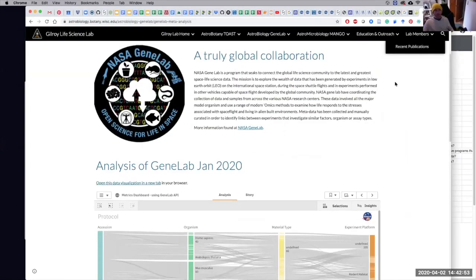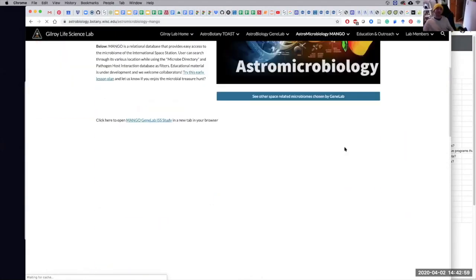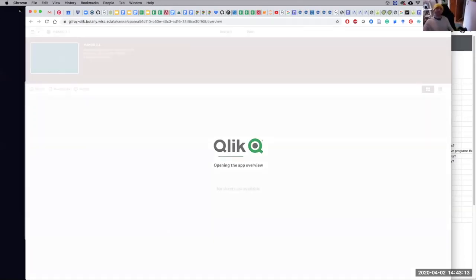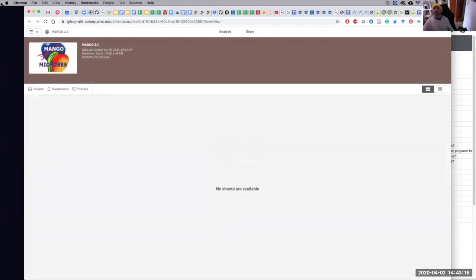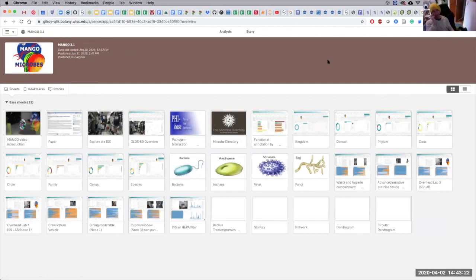Okay. So what I want to quickly do last is go to Mango. Mango's fun. Launch in a new tab. Again, classic thing: if you forget how to use it, you can watch this video. This one does have nasty electro music playing at the top. Do listen to it, or turn off the volume, because I'm no musician. It's meant to be a placeholder to edit a voiceover, but I'll never do a voiceover, will I? So again, similar structure, a selection of dashboards to choose from, but we're not looking at genetics this time. Instead of lists of genes, we're looking at the microbiome, so you have lists of microbes. Simple.